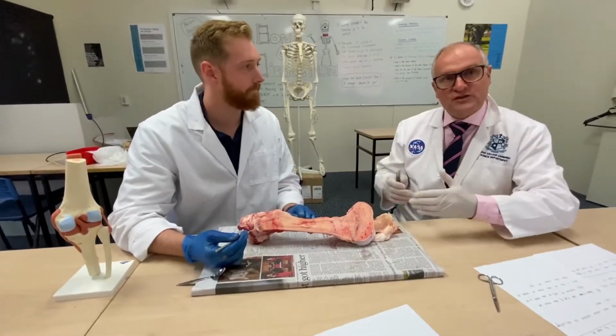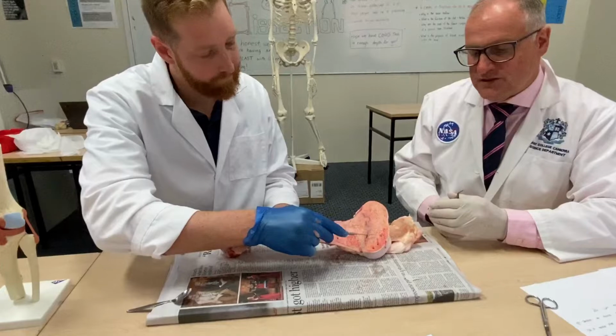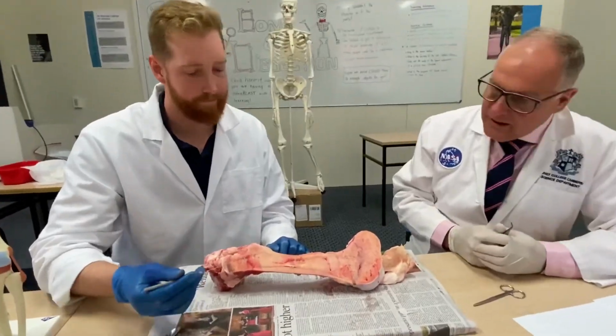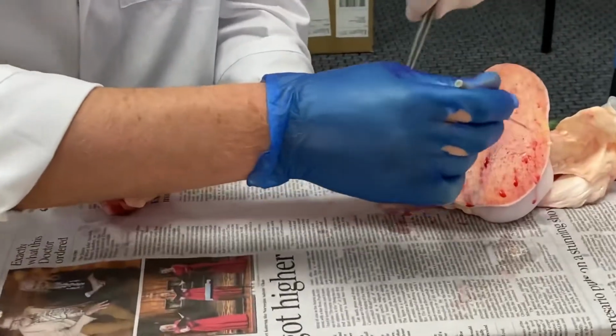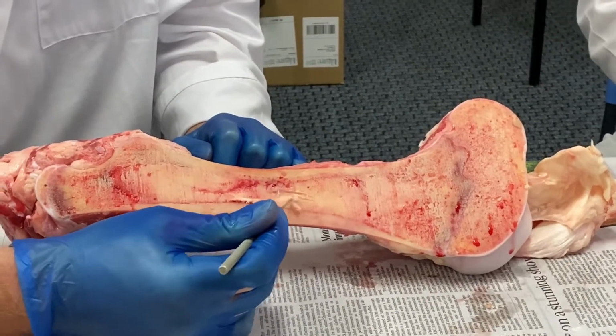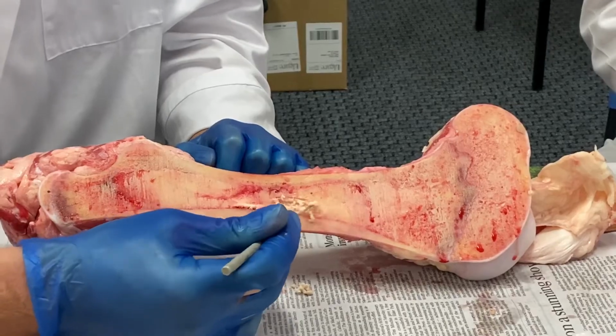So key part there, and we've discussed that as part of our circulatory system. Hopefully you can see the link together now: production of red blood cells, white blood cells, platelets, and where does this take place in the human body. So gentlemen, now sir's pointing to what is very solid and very hard. Now we're going to move into something totally different, this cavity which is hollow. This is the yellow bone marrow that sir's teasing away at right now.